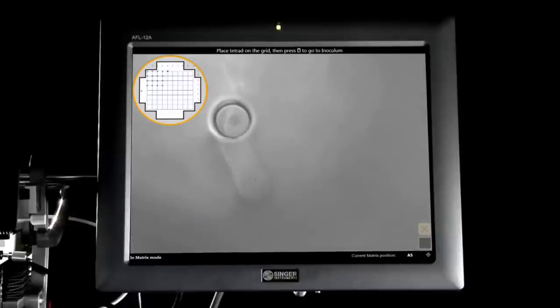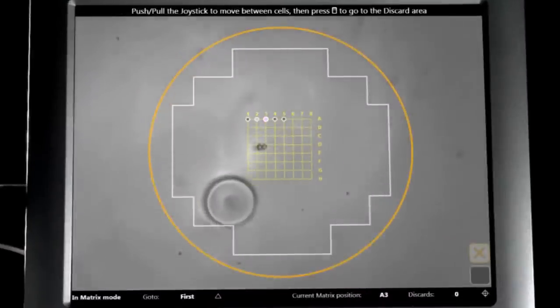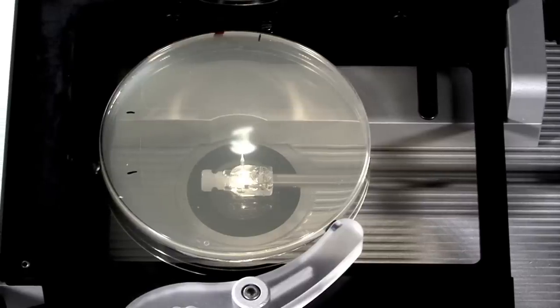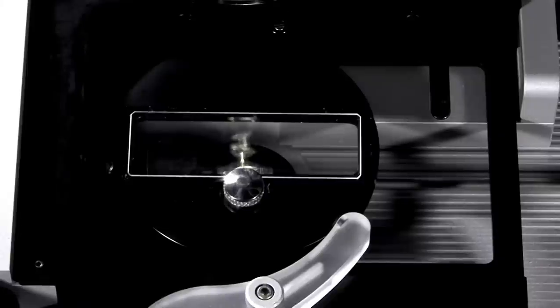Dissection. Screening. Aging. Petri dishes. Rectangular plates. Slides.